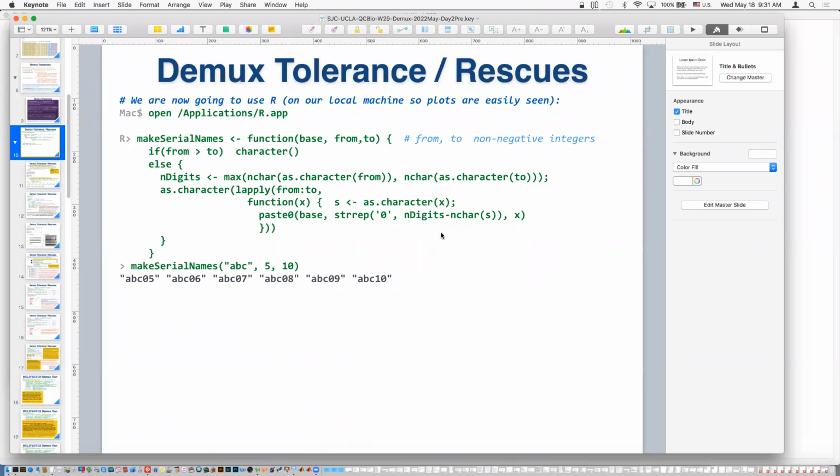Let's find out if the lane has cases, identify lanes that have cases that need remediation, and then also what the remediation is going to be, the details of it. This is what this analysis is going to do. And this is going to occur in R.